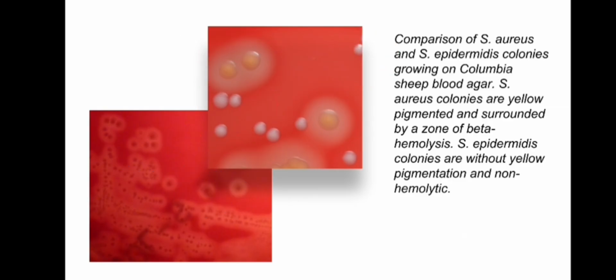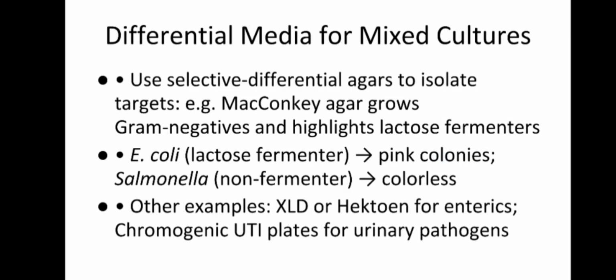Okay, so also you can use this test. We can use this test to differentiate between hemolytic and non-hemolytic species. Okay, now differential media for mixed cultures.